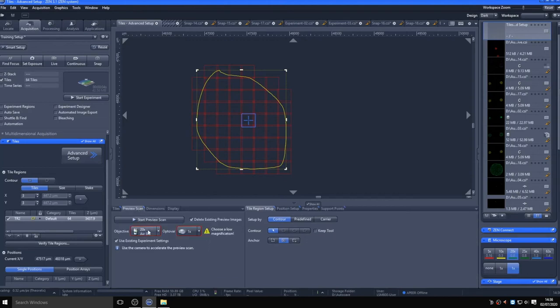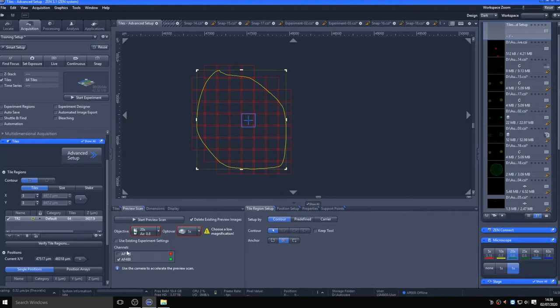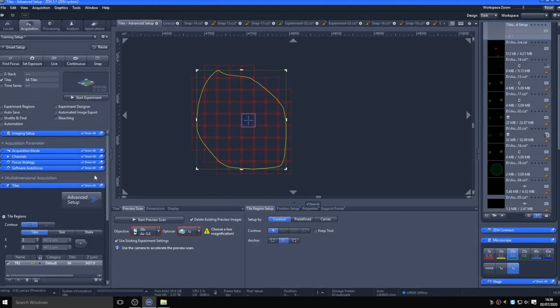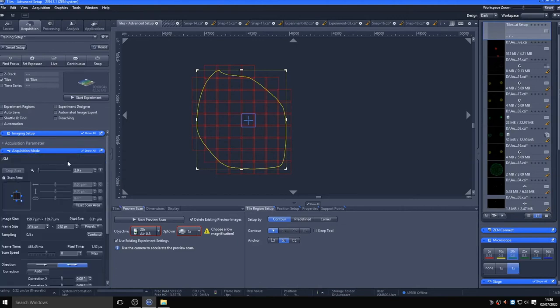This is a very powerful way to pre-scan entire tissue sections, then allowing you to draw a more accurate tile region for higher-resolution imaging. And when going back to two-container mode, can be used as a live map of the sample. This allows you to move around the tiled area and scan the fields of interest at a higher zoom or pixel density, or at better quality.